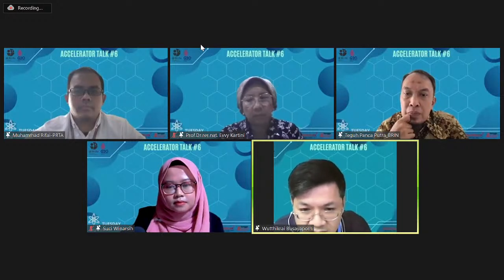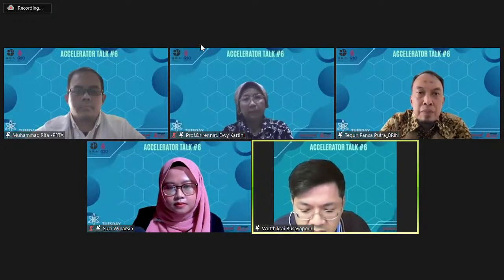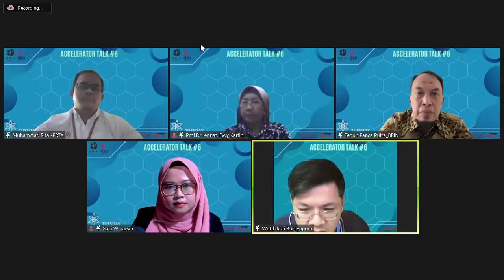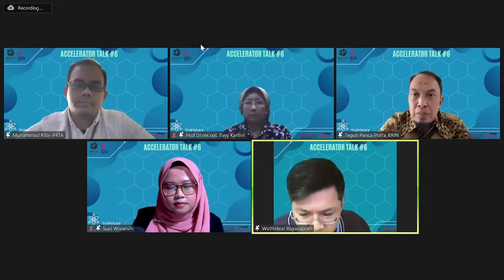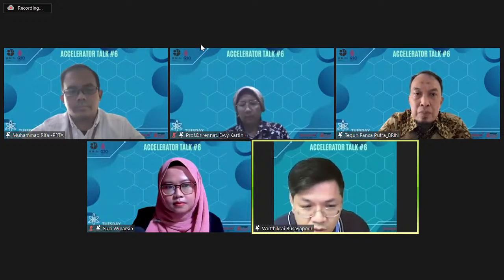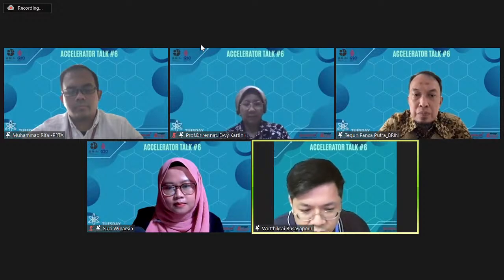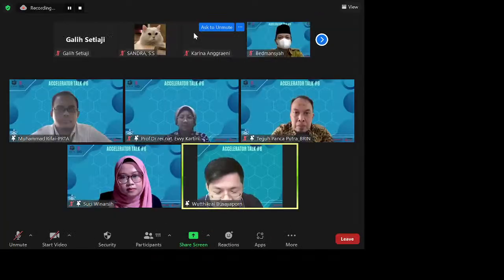That means you can come and help us. Not only the work at the beamline, but the discussion and the rapid, on-time change of the measurement settings is also important. Of course, if everything is going well, you can mail the sample in, and we do the experiment for you as a collaboration.